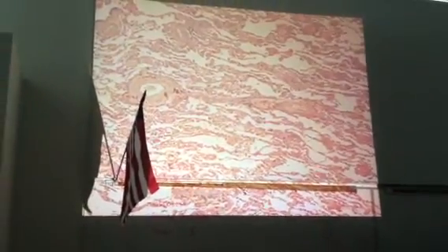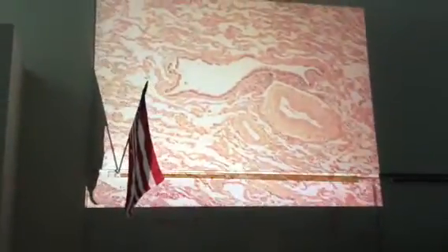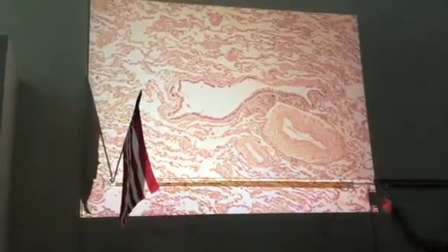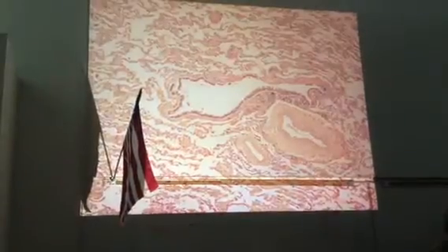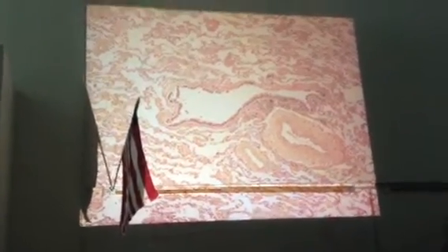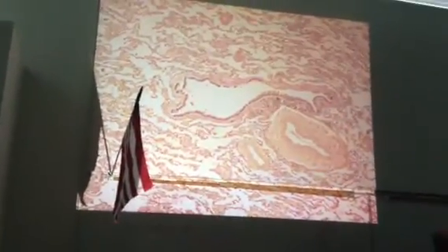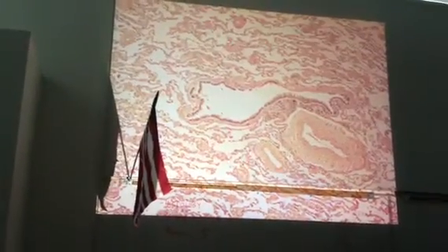You describe a bronchiole because it has, and there's only one in here, and there it is right there. It has a pseudostratified ciliated columnar epithelium, and there's no cartilage in the wall. So the first set of tubes that we go into in our lungs have cartilage in the wall to keep the bronchi, primary, secondary, tertiary, and the first part of the bronchioles from collapsing when we create a negative pressure so we can take a breath.